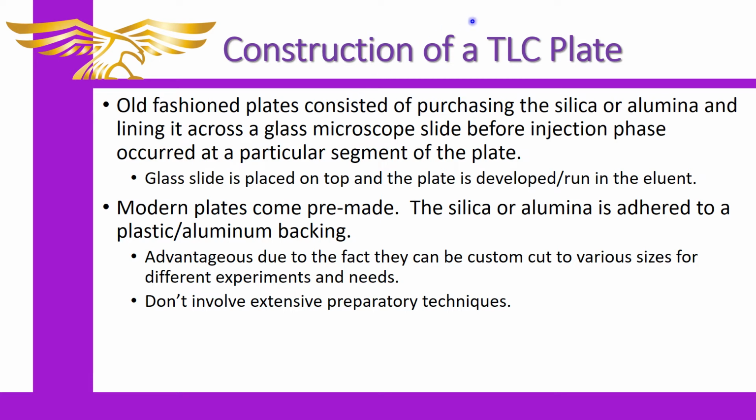And if you had to do any kind of special development technique, you would have to take that top slide off and work with that, or you'd have to run it without it and let it dry on there. It would be very different compared to the way that we're doing it now, which is a little more streamlined and easier to do. I've never seen this done the old-fashioned method.